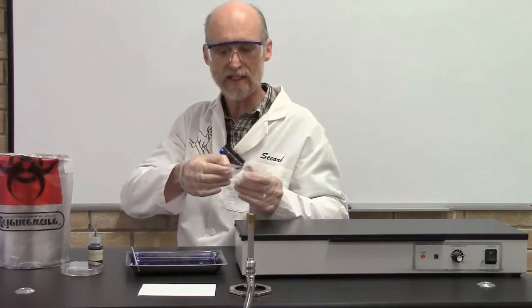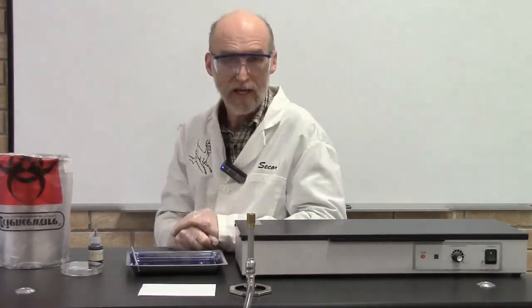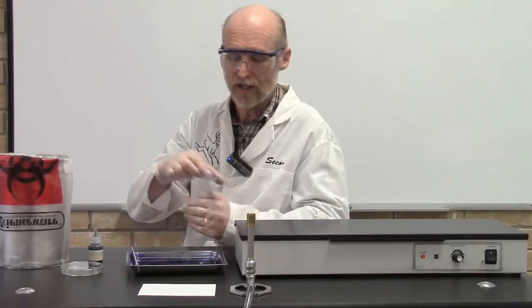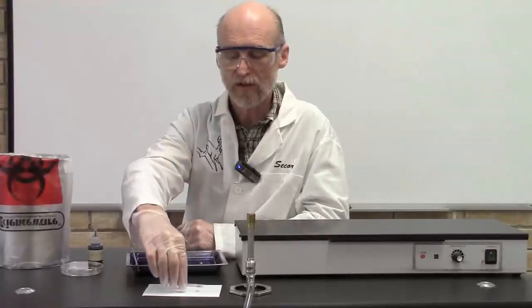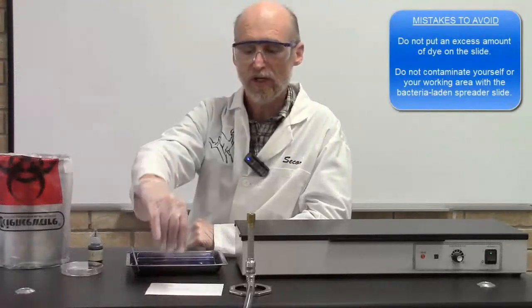Now we're going to take this and put it on our slide warmer. As the water evaporates, the dye actually bonds the bacterial cells to the slide. And you end up with your finished product. Now let me put this on this bibulous paper so you can see what the final product should look like. There you have it.